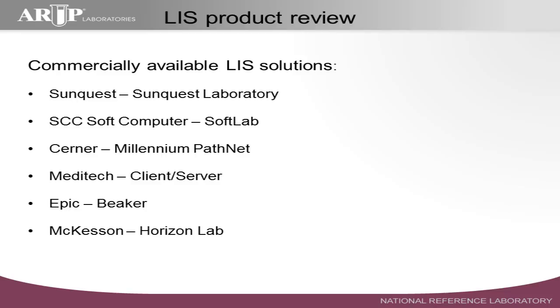One that's really gaining in popularity is Epic Beaker. Now Epic has been around since the late 1970s, but they really focused for many years on the hospital side of things. So they produce what's called an electronic medical record, and that system is very popular.